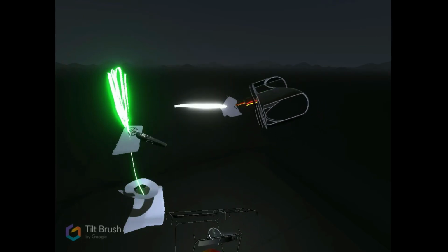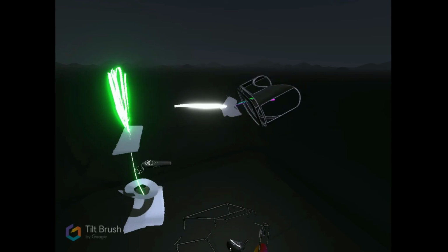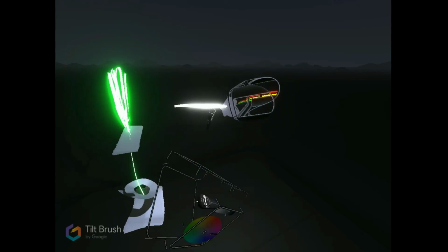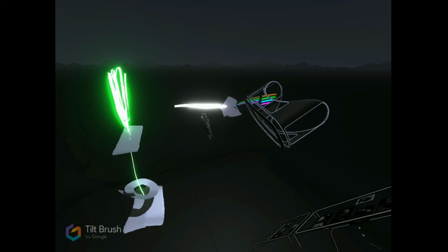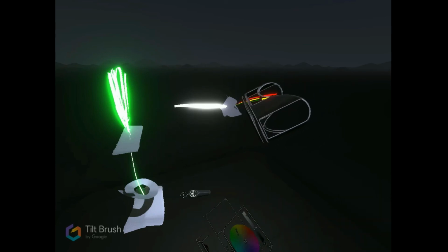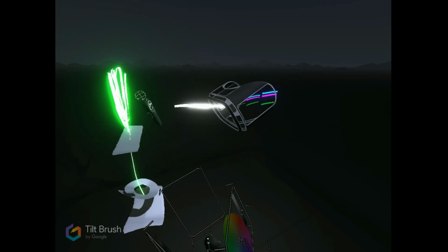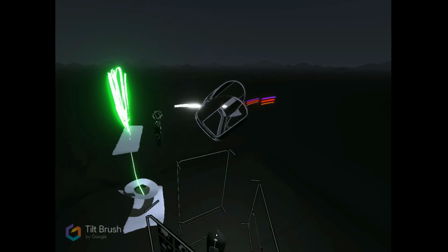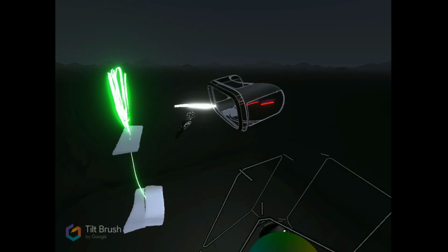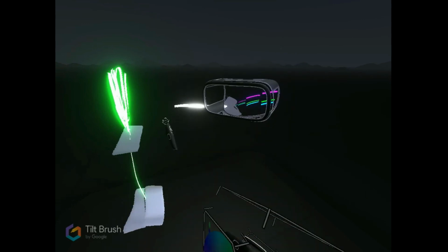But you see, the thing is, because that spot only exists because of the sample, that spot will be exactly like dark field in a light microscope, where the background will be a little bit darker and the sample will be a bit brighter, because only the electrons that are bouncing off of the planes of atoms in the sample go to that spot, and that's TEM dark field for you. So that's the basics of what diffraction is, not how it works, but what it is.